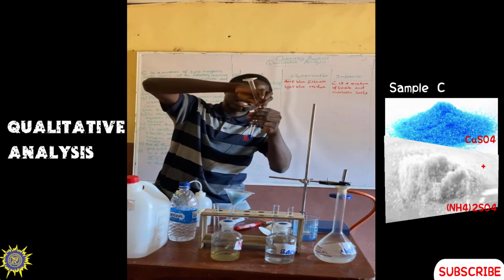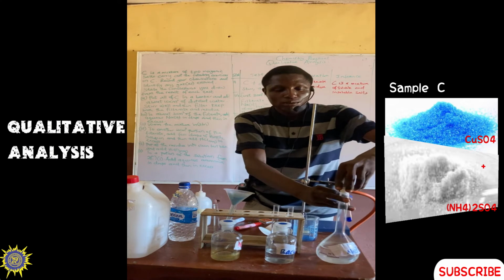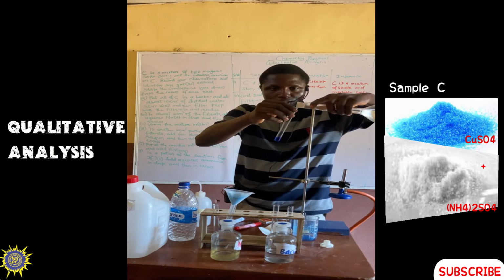So to this 2 centimeter cube of the filtrate, we have to add sodium hydroxide in drops. Add sodium hydroxide in drops first and observe the color change.